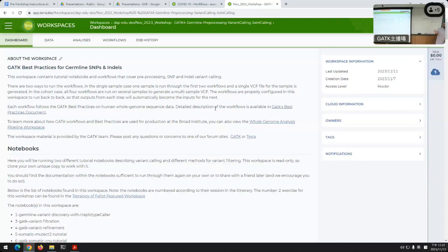everybody has to make a unique name for their workspace because we're all on one billing project together. So that's the constraint. It has to be unique per billing project. So you guys have the same initials, for example, like I have initials that are similar to other people's initials. So I end up just writing some random string or a funny phrase.